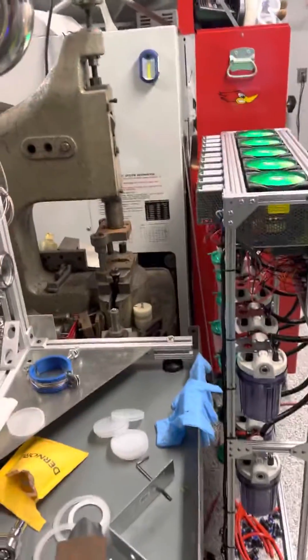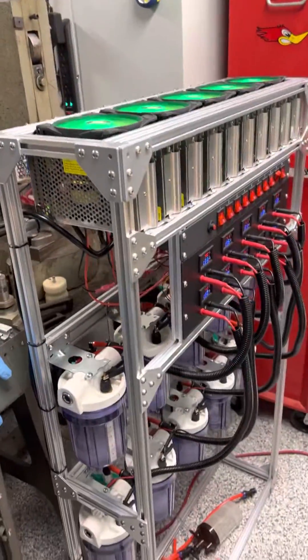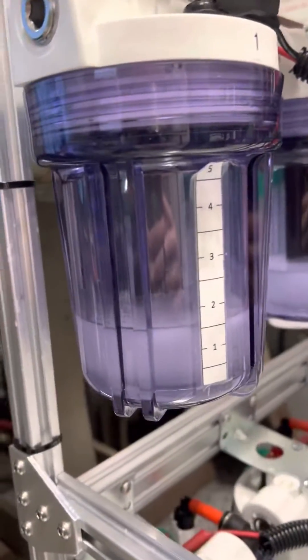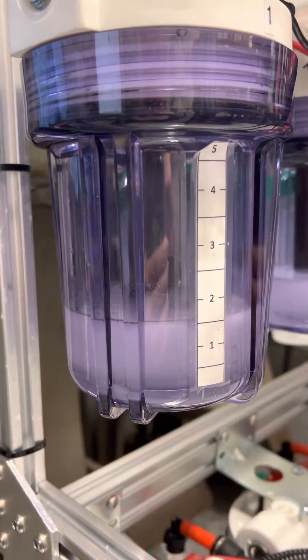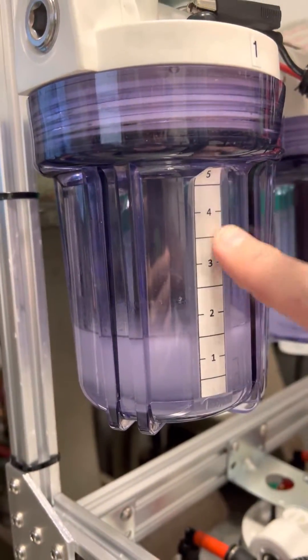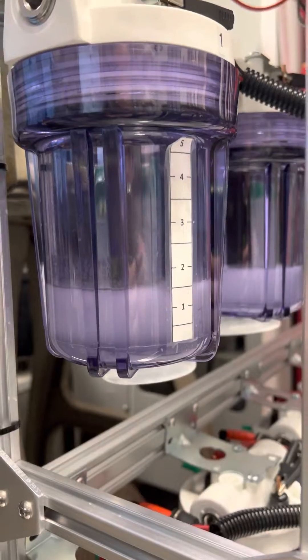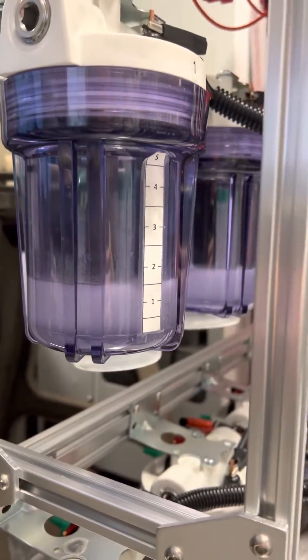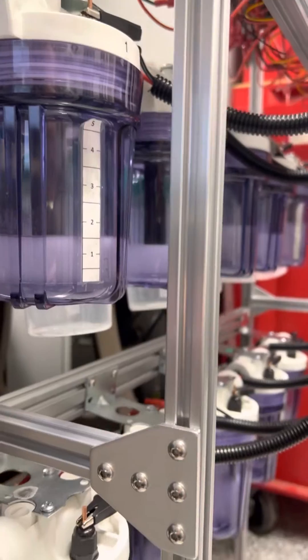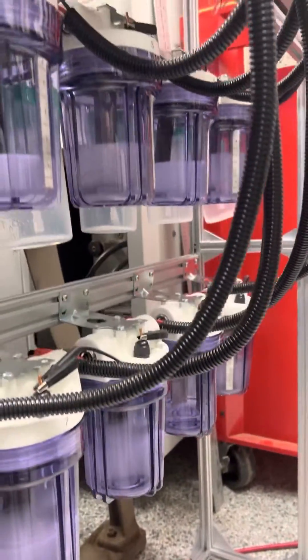Hey guys, it's easier if I just make a quick video showing what I added here. First I'll show you my electrolyzer — it's doing good. When it gets down to one, I've done a five-to-one reduction on all of these cells, and then I'll combine it and reduce it again. That will give me a much higher concentration of deuterium oxide.